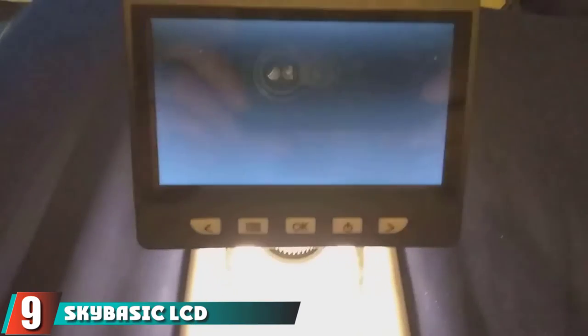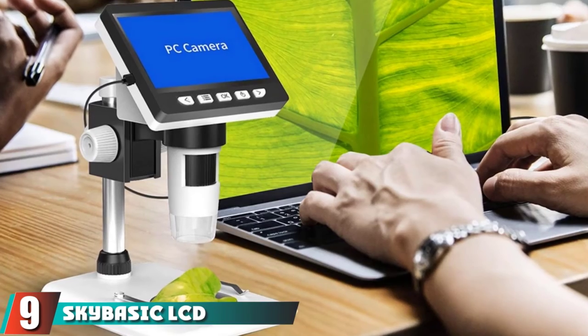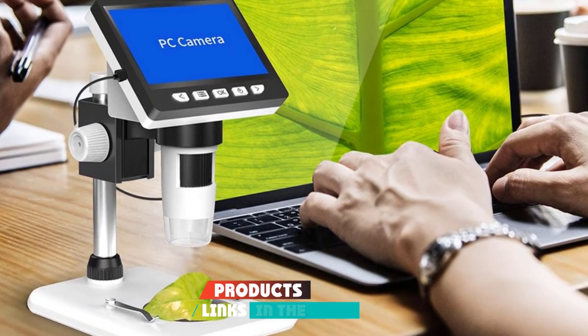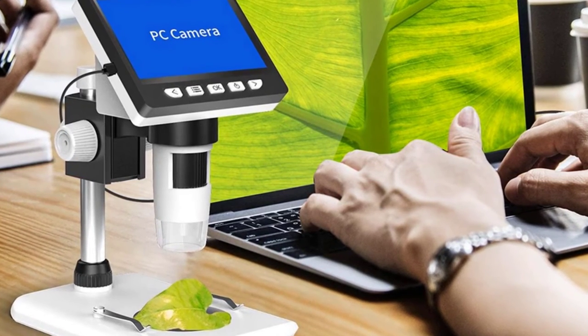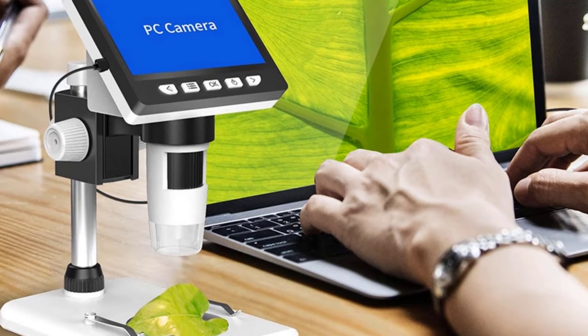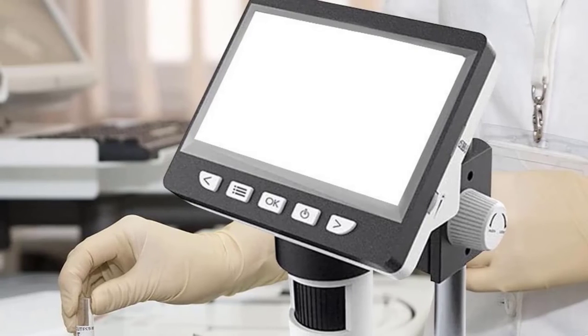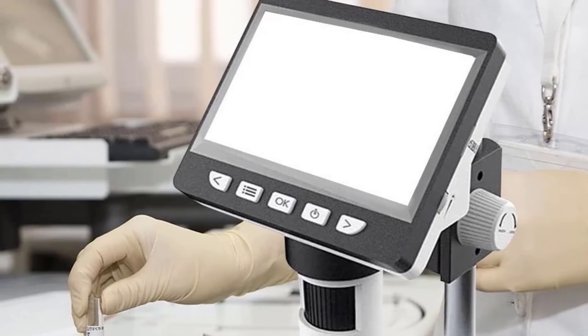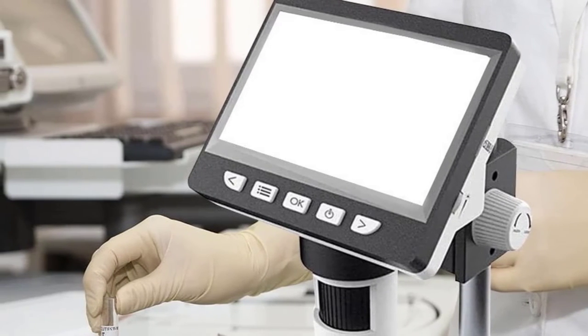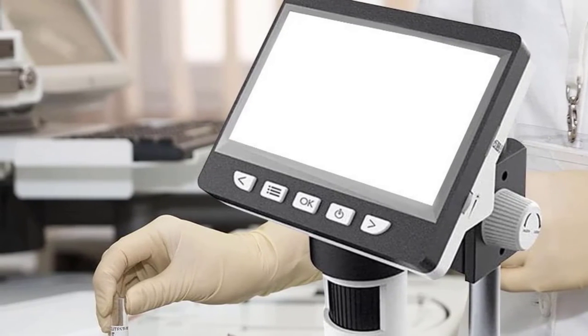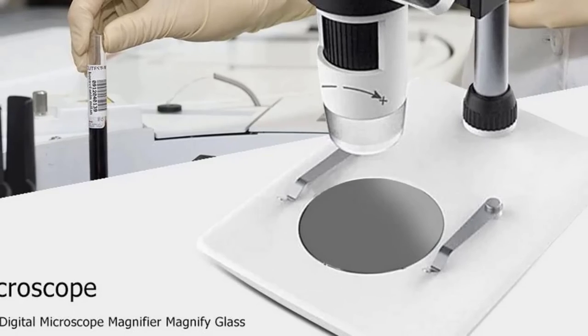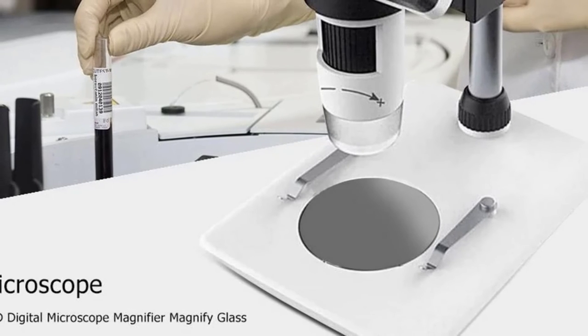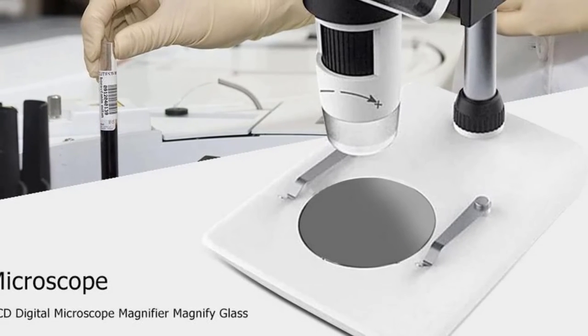Next at number nine, we have SkyBasic LCD Digital Microscope. SkyBasic LCD Microscope is perhaps one of the most revolutionary on the list. If you're looking for a digital gadget that has a built-in screen, then this might be the best microscope for kids and even adults. It comes with an included and dedicated 4.3-inch LCD panel to view the specimen in question. The rotating head makes viewing easier. The device can magnify from 50x to 1000x, which is fairly abundant. Plus, the coarse/fine knobs refine the image further.